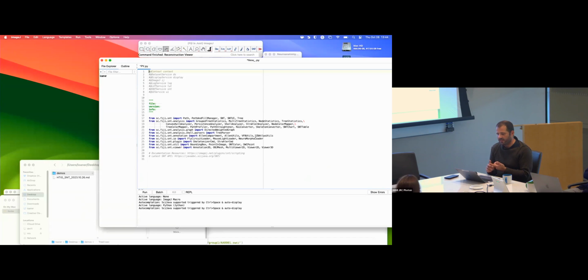Debugging, it's nice in Groovy, but you don't have auto-completion. And then I was telling about the grumpy reviewer. So we did some things here to make it better. So auto-completion, that was done with Albert Cardona.